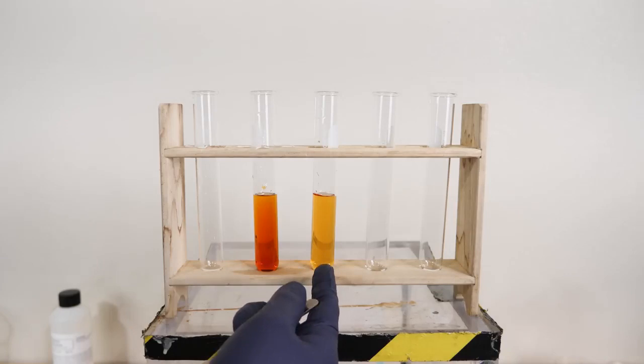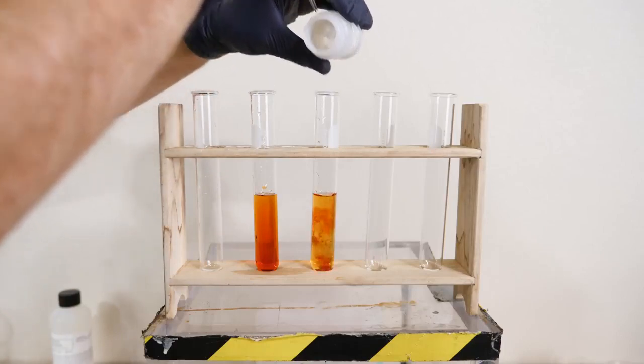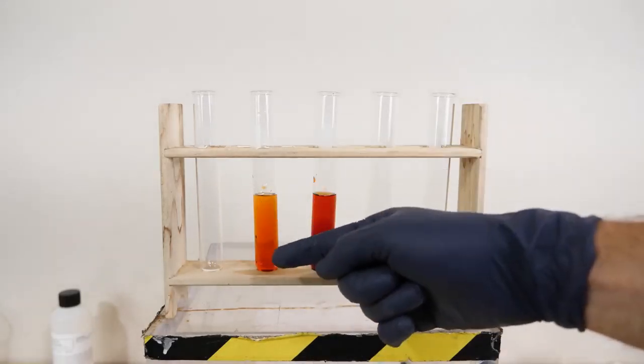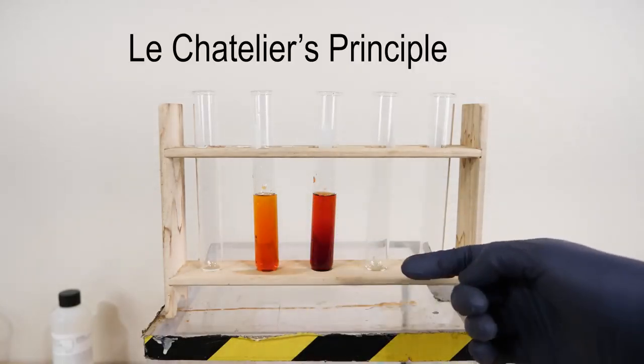So in this one, I'll just add some more thiocyanate to it because we assumed that the iron got all used up. So here's a crystal of thiocyanate. And we can see that this turns it red too. So you can see that whether I added iron or thiocyanate, we got more of the products. Now what you just saw here is something called Le Chatelier's principle.